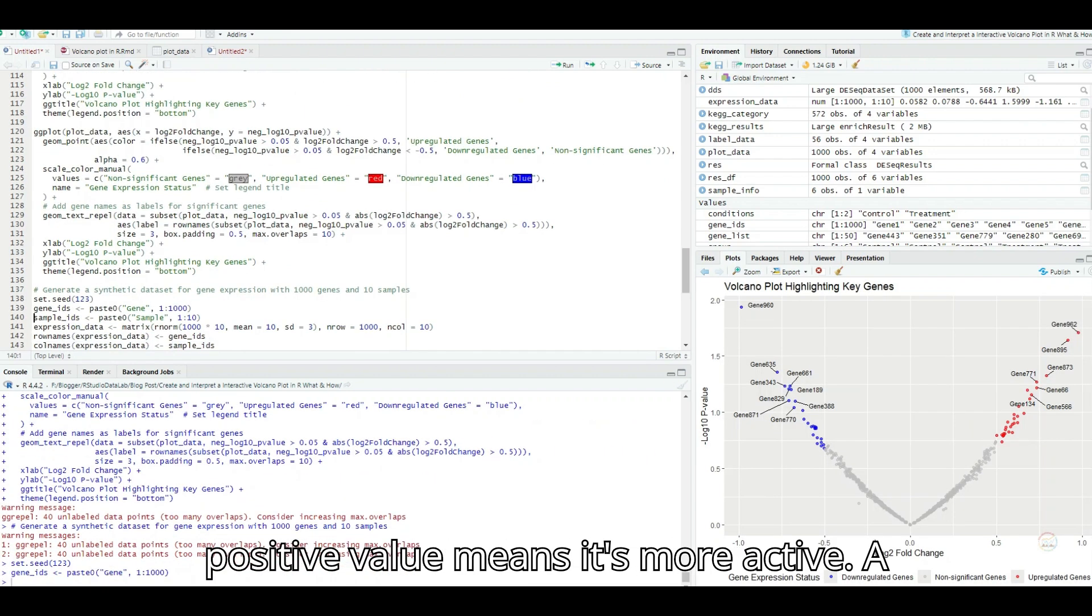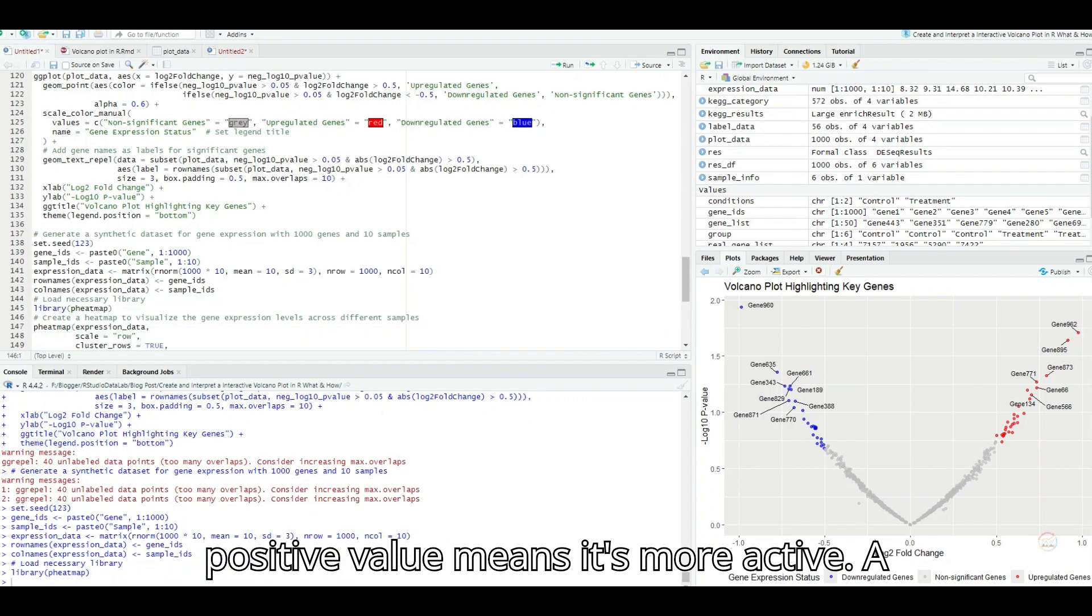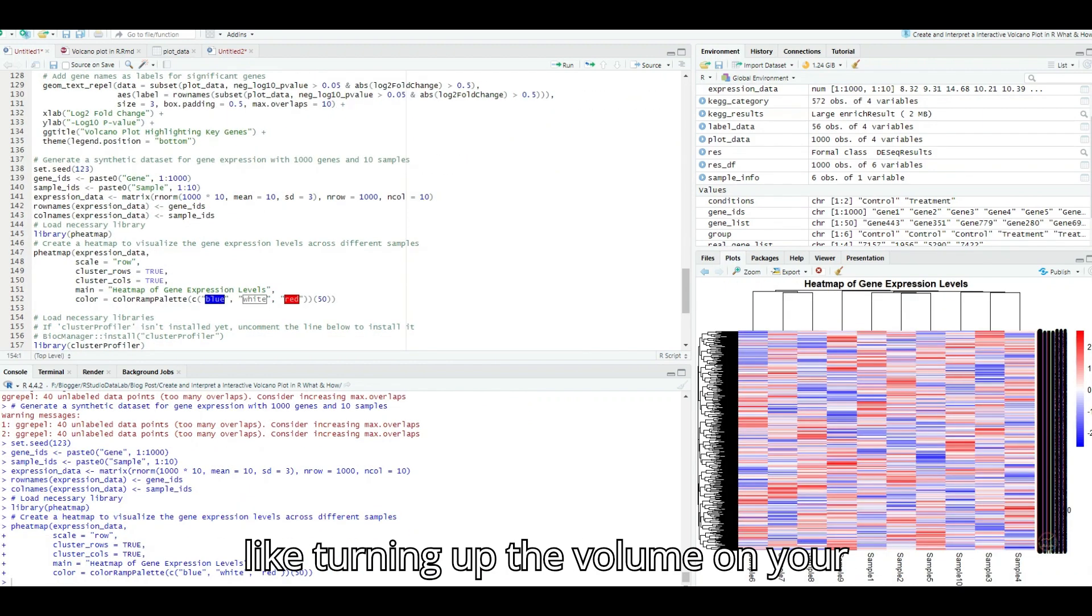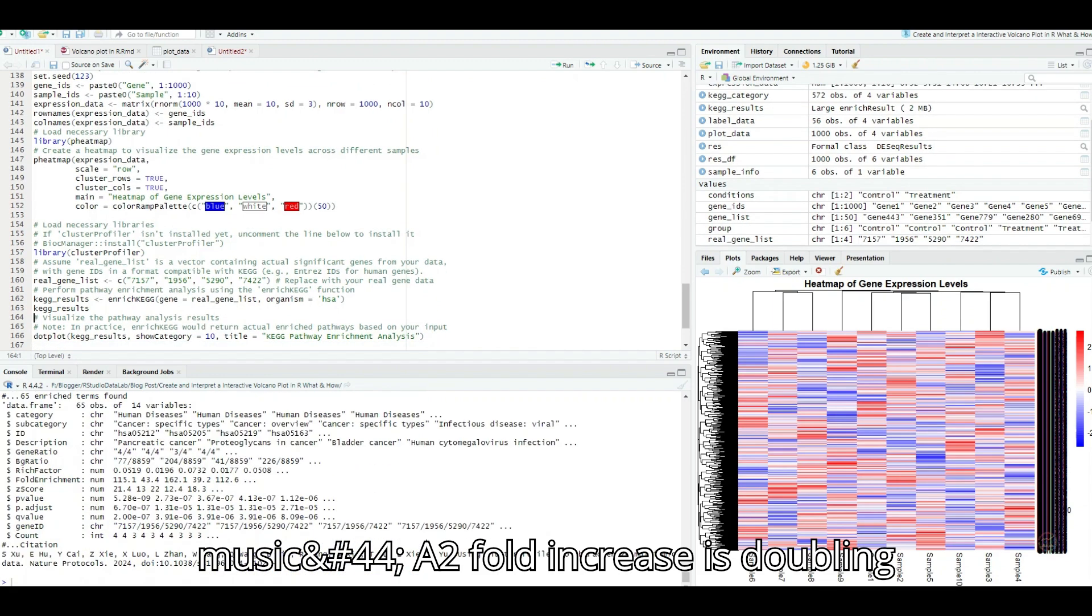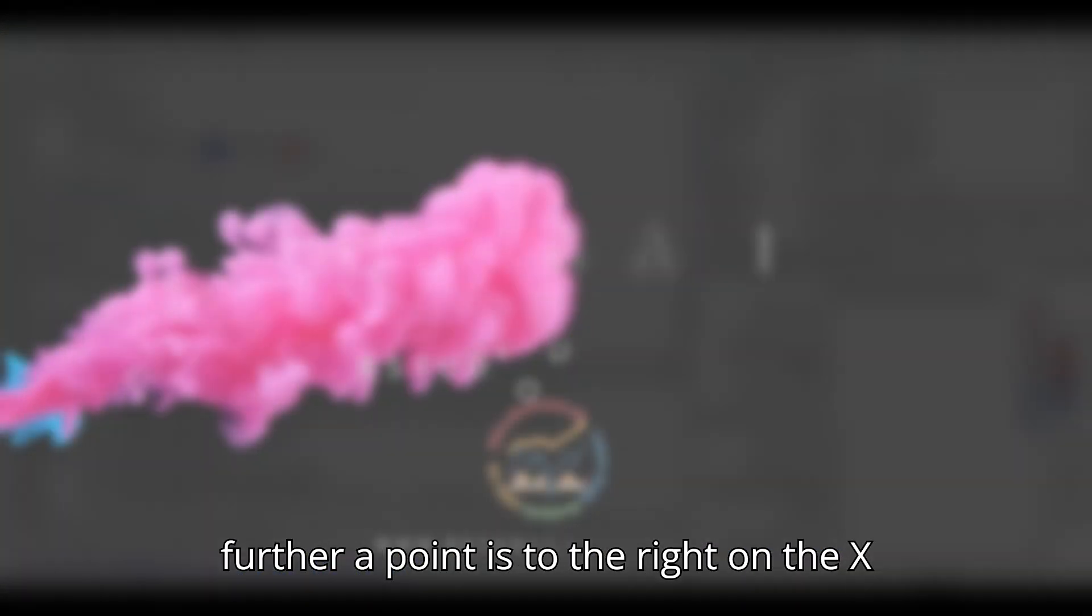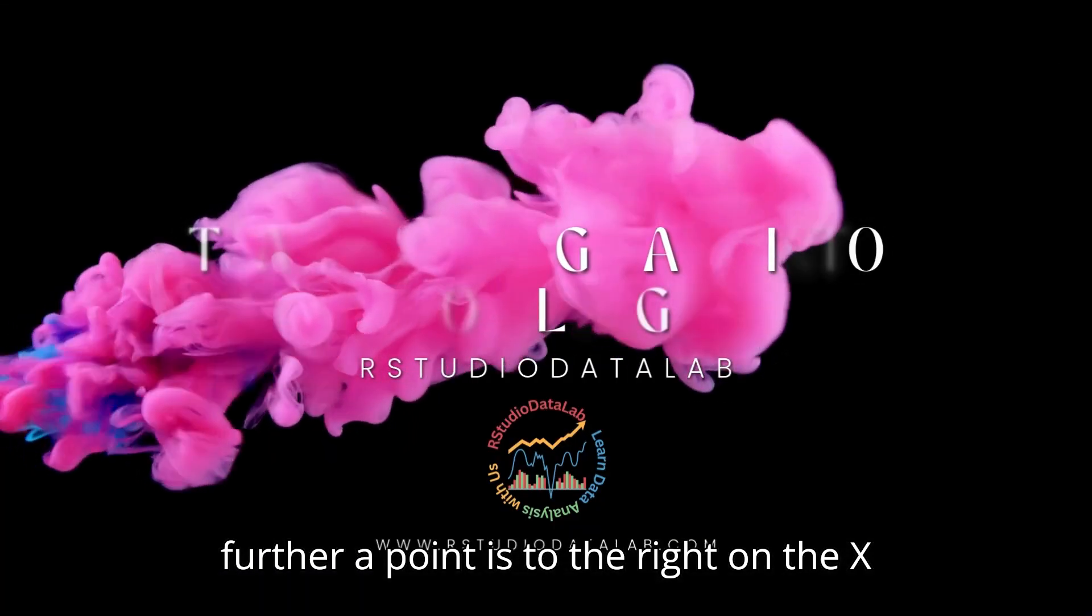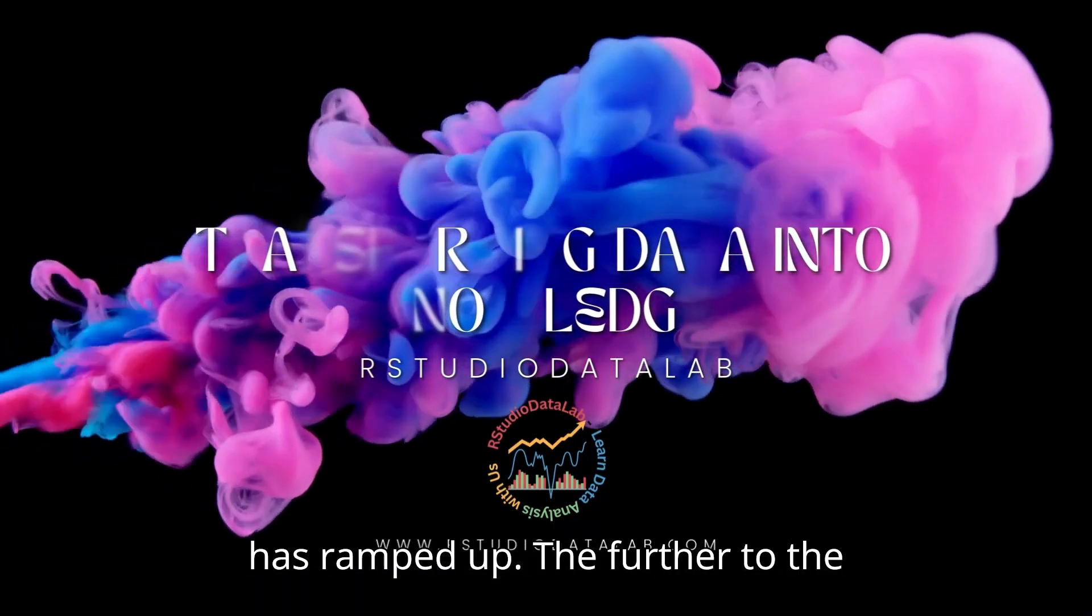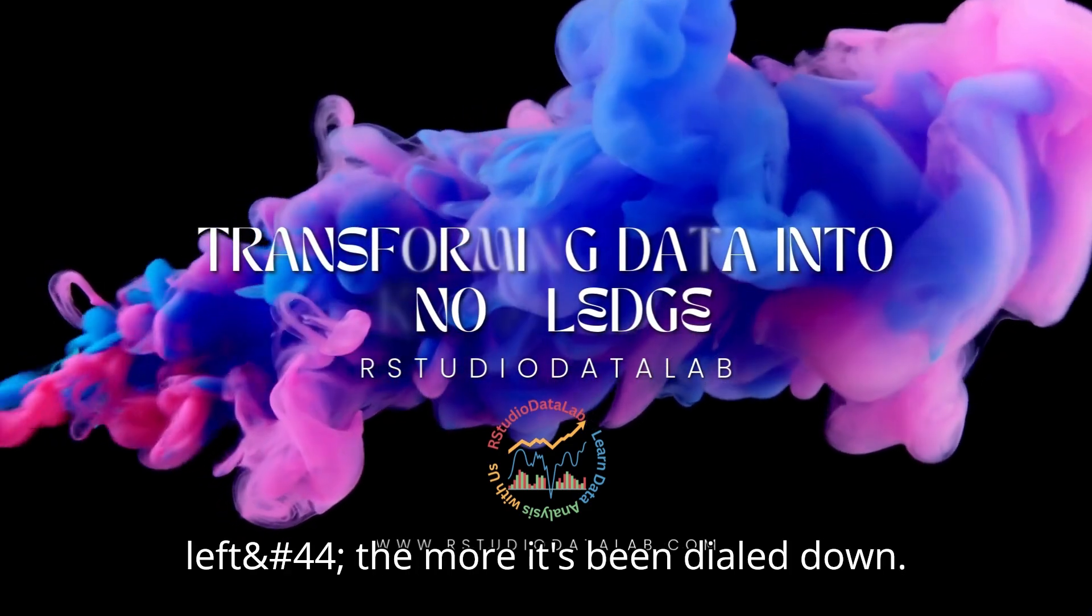A positive value means it's more active, a negative value means less active. So like turning up the volume on your music, a twofold increase is doubling the loudness. Exactly. And the further a point is to the right on the x-axis, the more that gene's expression has ramped up. The further to the left, the more it's been dialed down.